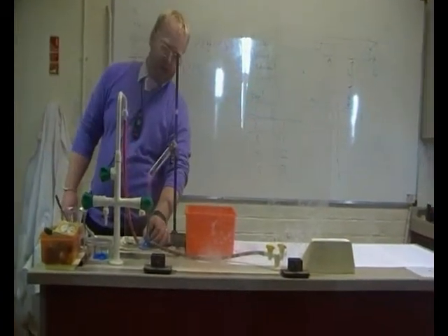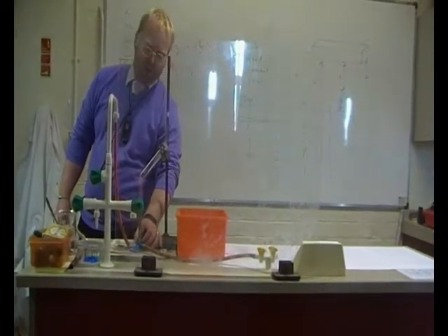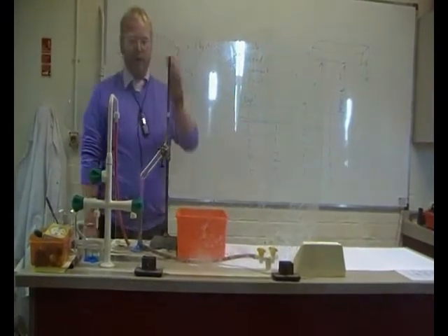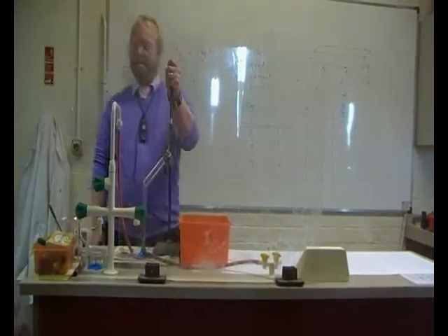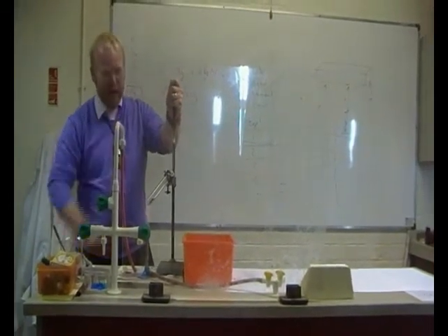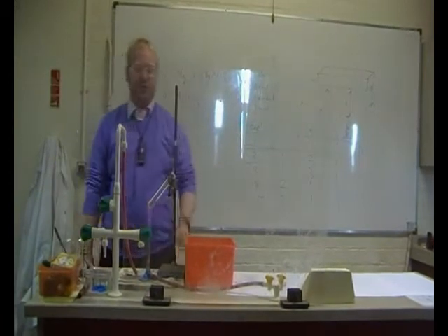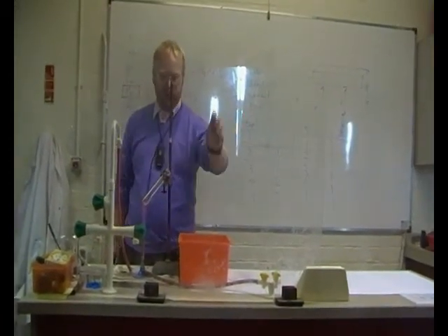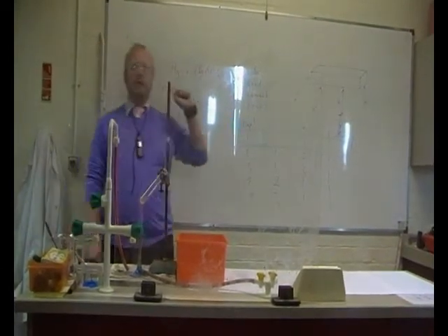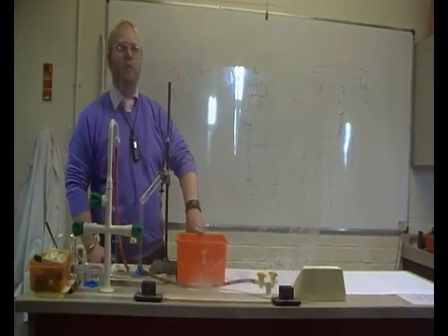We can actually explain what's going to happen and possibly predict and understand why it all happens if we think carefully. So, I'll tell you a little bit about what I'm going to do. In a moment, once this has been heated for a while, I'm just going to get that boiling tube and put it into this cold water here. Hot boiling tube into cold water.